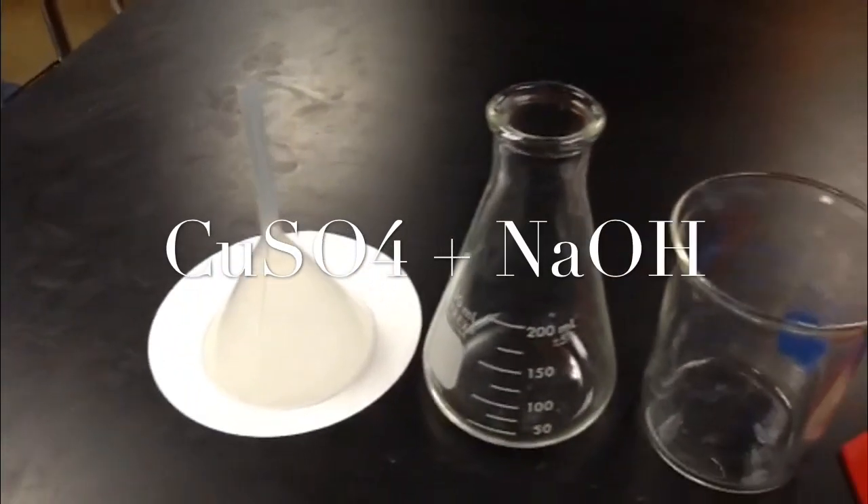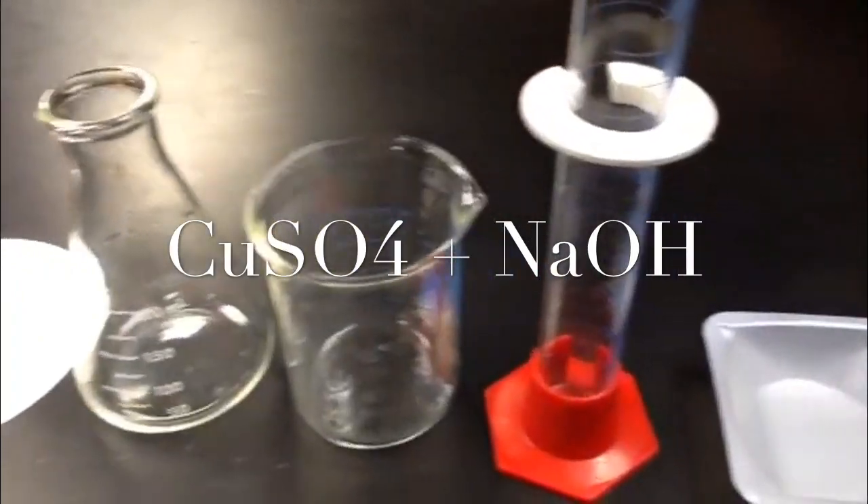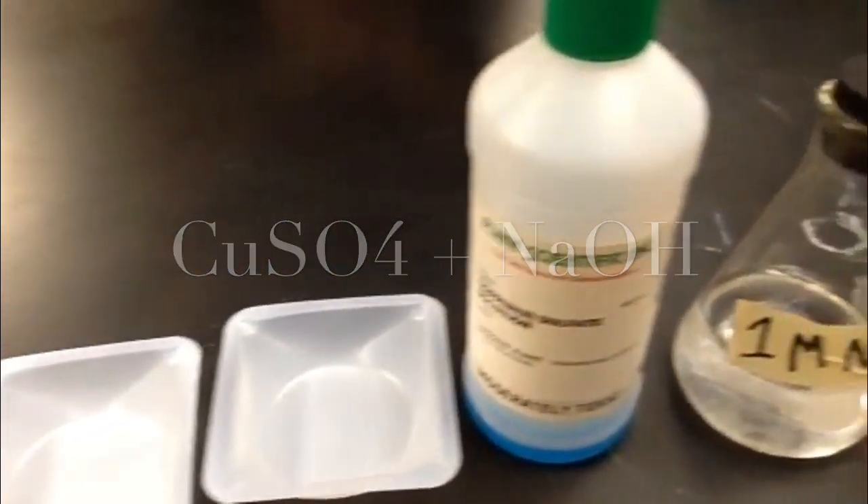Filter paper, pipe, funnel, Erlenmeyer flask, graduated cylinder, two weigh boats, the copper sulfate, and the sodium hydroxide.